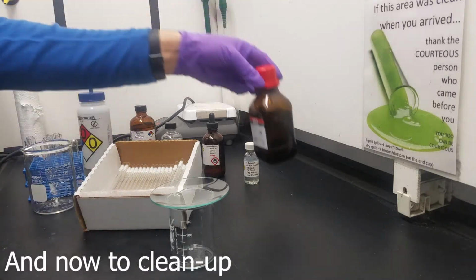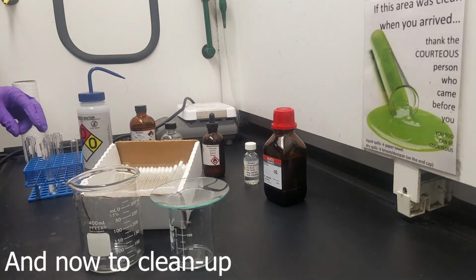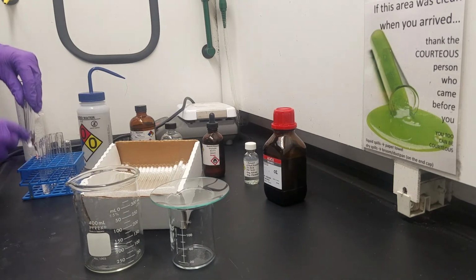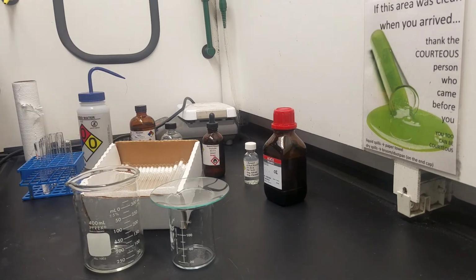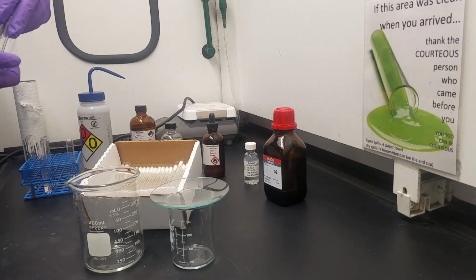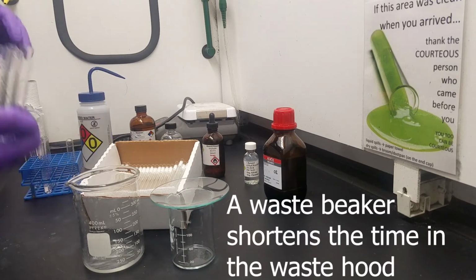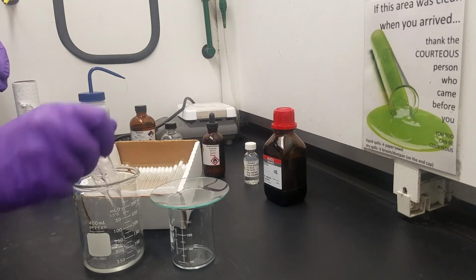Really now we're about to clean up. So note that we tried to make sure the lid was on nice and secure. It is my recommendation that you have a waste beaker handy so that you can dump all of your small test tubes or other reactions into a single container and then dispose of the waste from that beaker into the waste hood. Otherwise, you end up spending a lot of time in the waste hood, and that's just annoying.